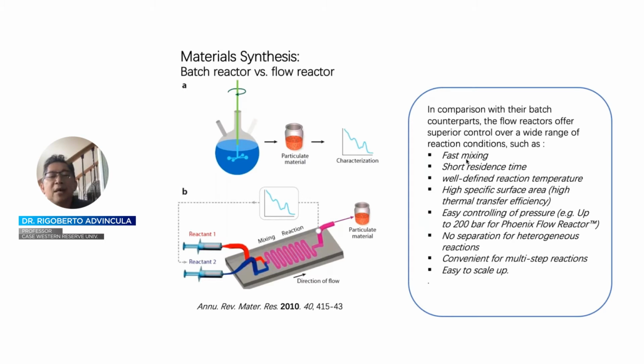Whereas this diagram shows that if we simply have a flow condition, let's say where we mix the reagents or reactants 1 and 2, and then we control the mixing as well as the environment of mixing, that is temperature, pressure, and flow rate, we are able to isolate the product, and as I'll show you, in high yields, with precise synthesis and different types of combinations that allow us to control the kinetics of the reaction, but more importantly, put the control in your hands as a process parameter rather than simple mixing.